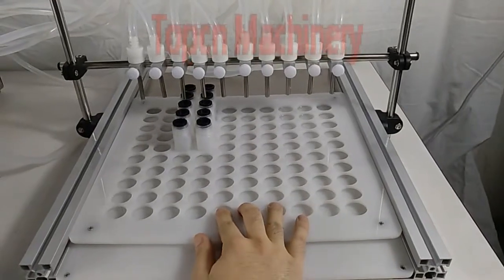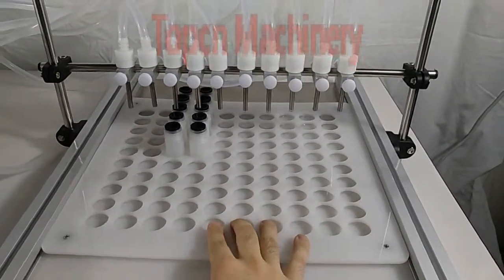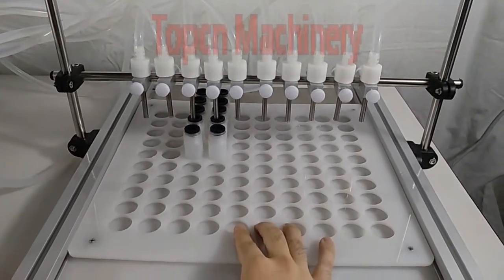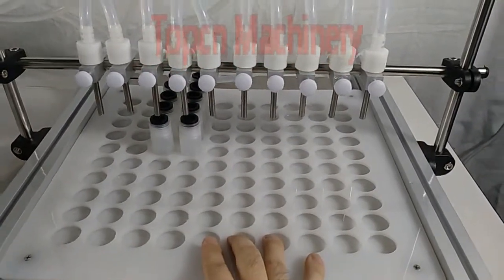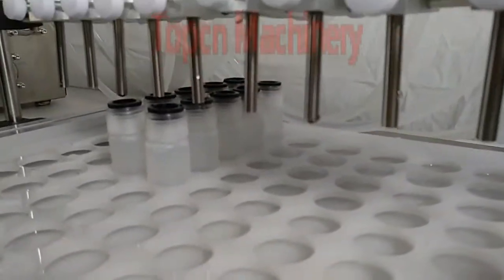One, two, three. One, two, three. One, two, three. That's it — it's very easy and very convenient.